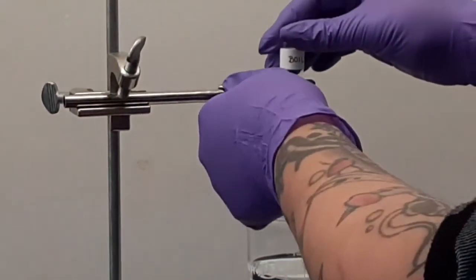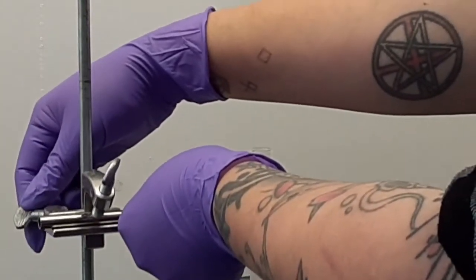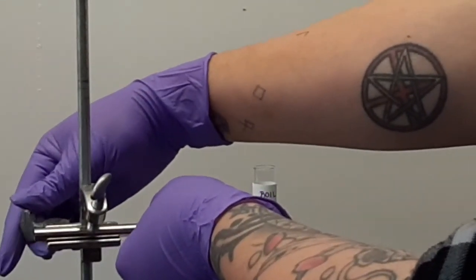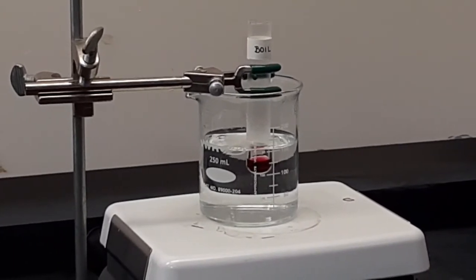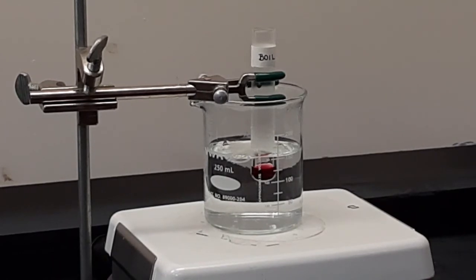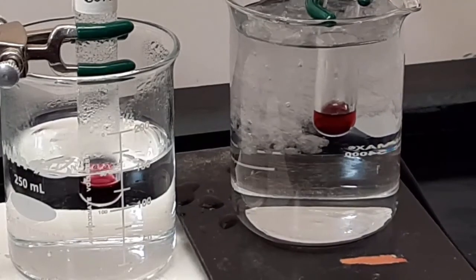Now we'll go to the boiling water. Now this is going to take some time. So we're going to skip ahead and do a comparison. You can plainly see there is a color difference. And that's it.